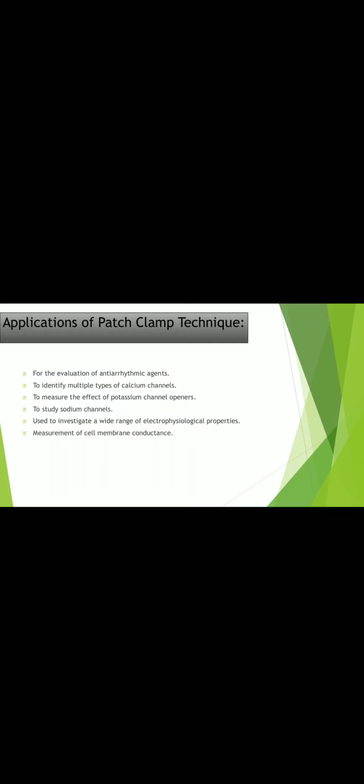A number of samples are required, and we have to apply this technique many times so that we will have proper results. And to carry out this technique, we need a skilled person, so that all the ion channels present on the membrane get inserted into the pipettes. Then only will we be able to go for the recording of the cells.